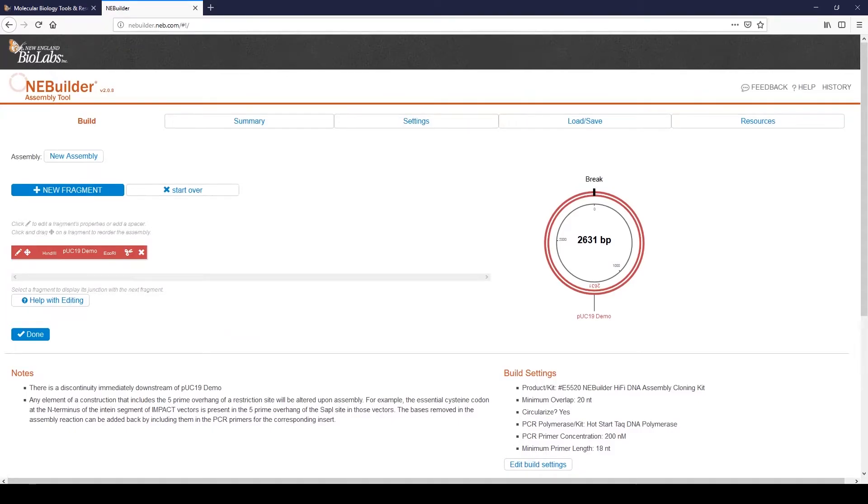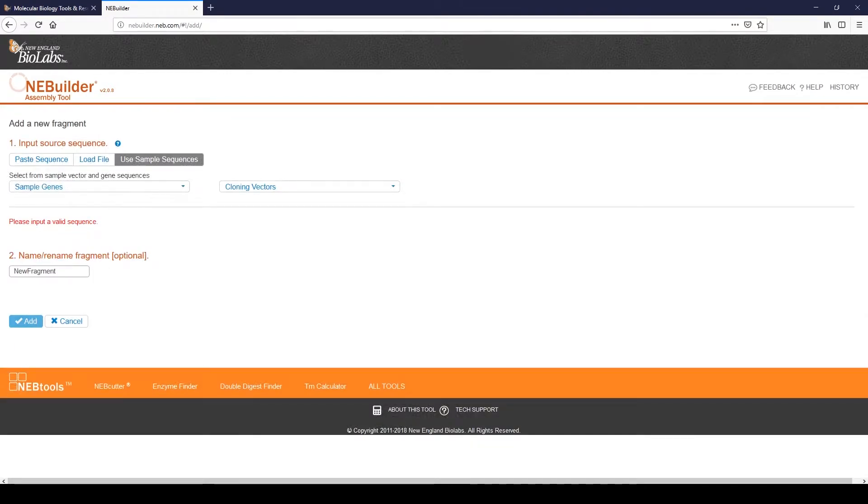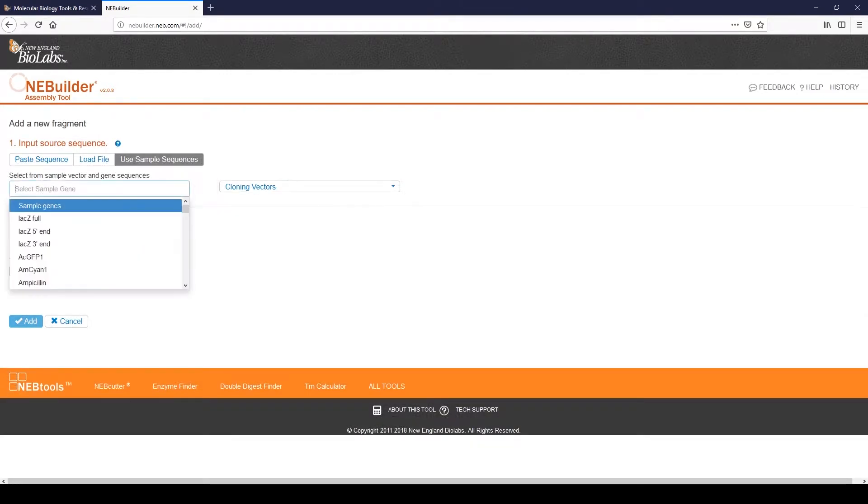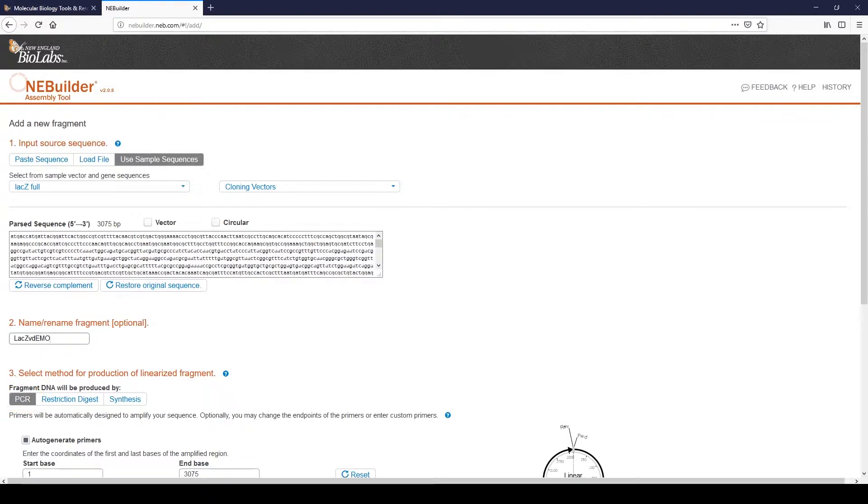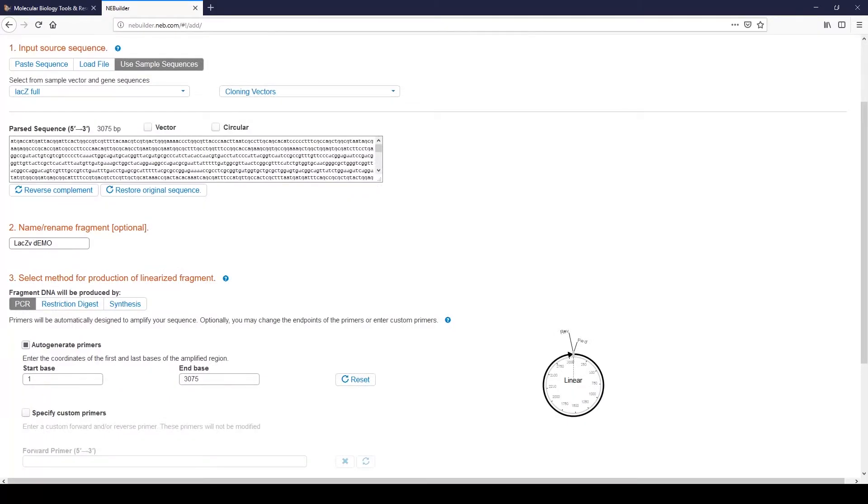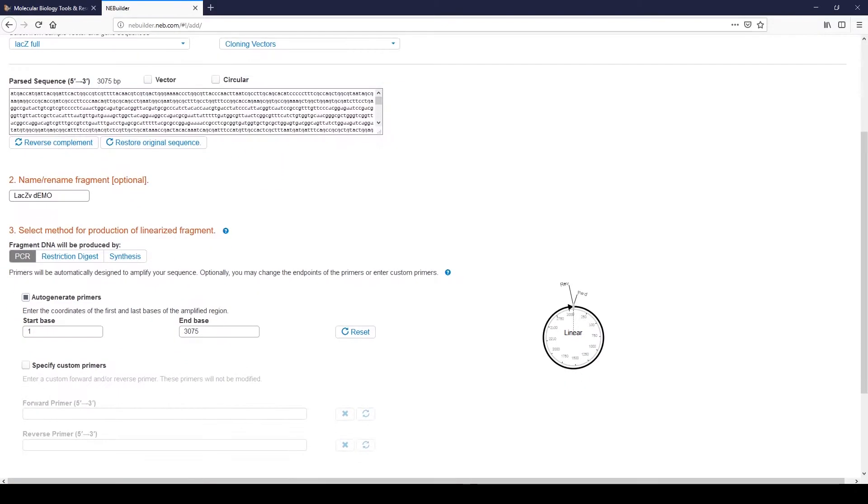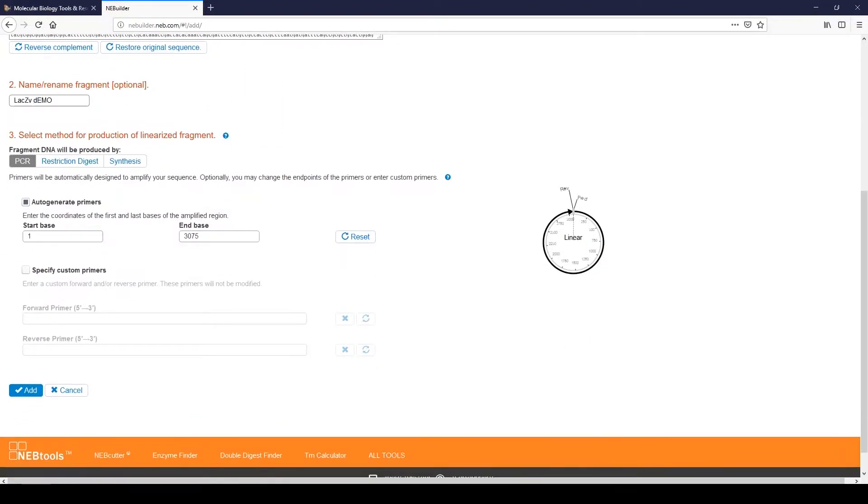Next, we will add Insert Fragments. Click Plus New Fragment. We will use a sample sequence. Select LAC-Z Full from the drop-down menu. Name the fragment. Select PCR as production method. Be sure that Auto-Generate Primers is selected. If you prefer, you can use custom primers instead of having the tool designed primers for you. Enter the start and end bases. In this case, we will use the entire sequence. Click Add.